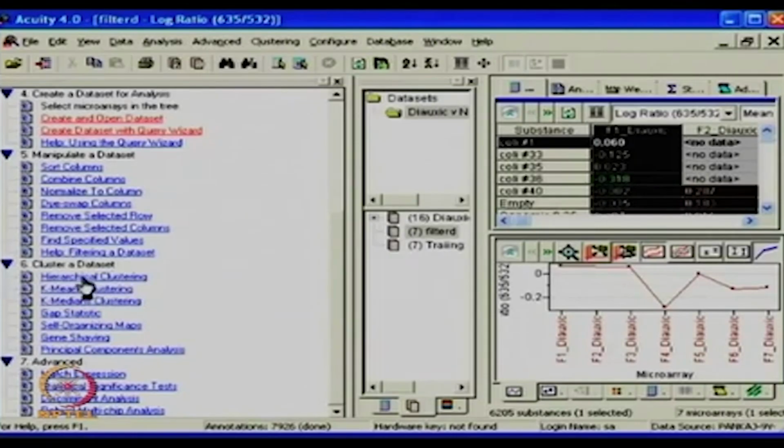And once you do have the results and an idea, you can cut down, because hierarchical is a little RAM consuming. It takes a little bit more time, because you can imagine all has to be linked to one. And there are different ways of doing it: center based, coefficient correlation based or distance metric based, and lastly binary based.